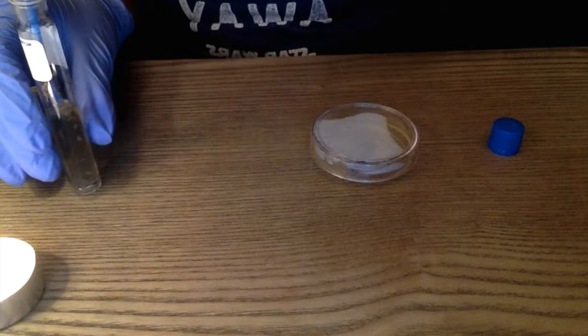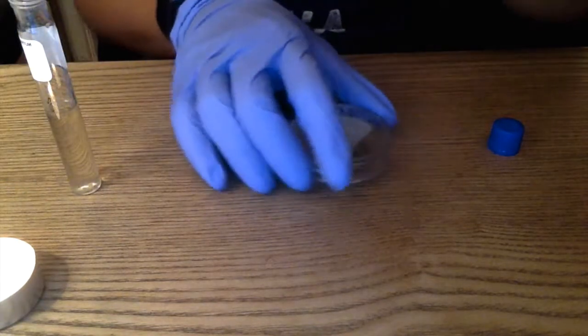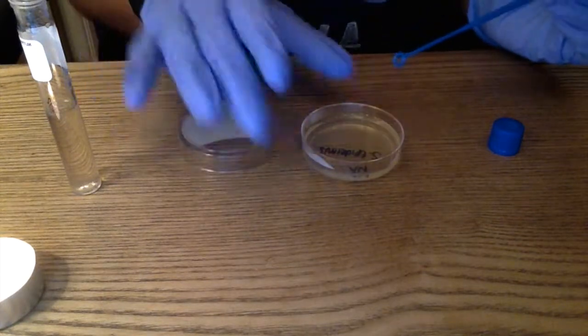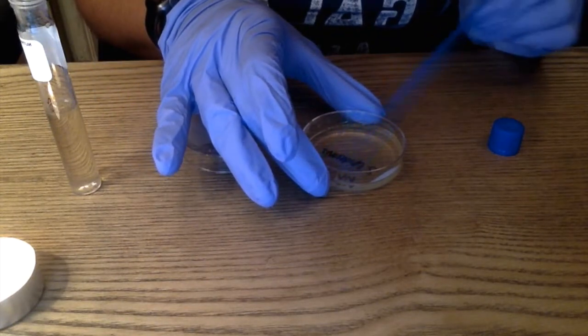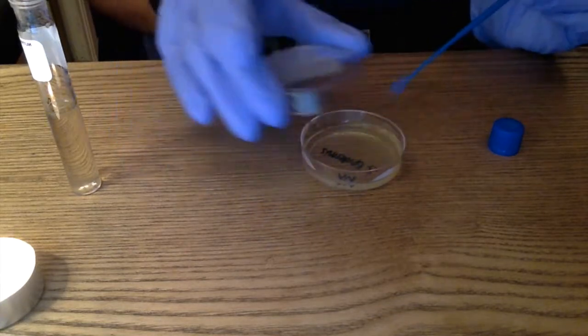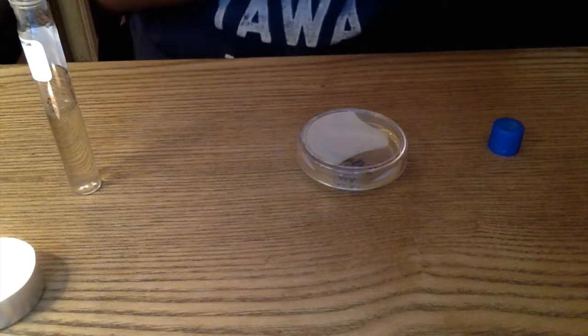And what I'm going to be doing is I'm going to be in zigzag formation, placing this inoculation loop into quadrant 1 of this here agar plate. So we go zigzag. Perfect. I can recap that. Putting the inoculation loop back into the alcohol.